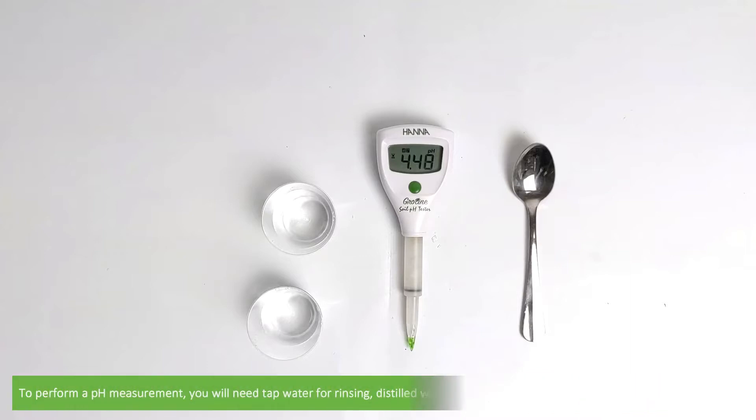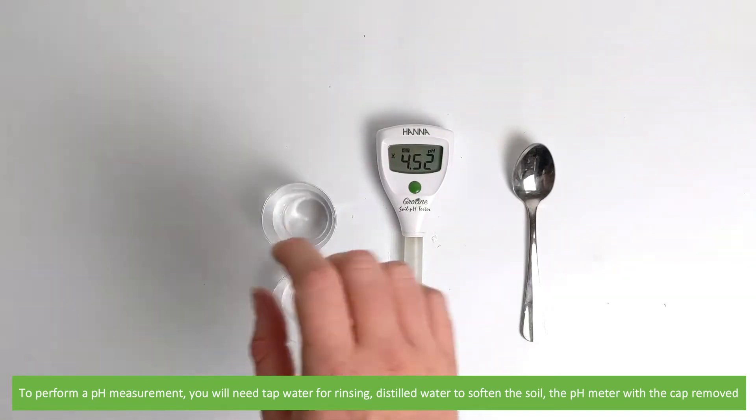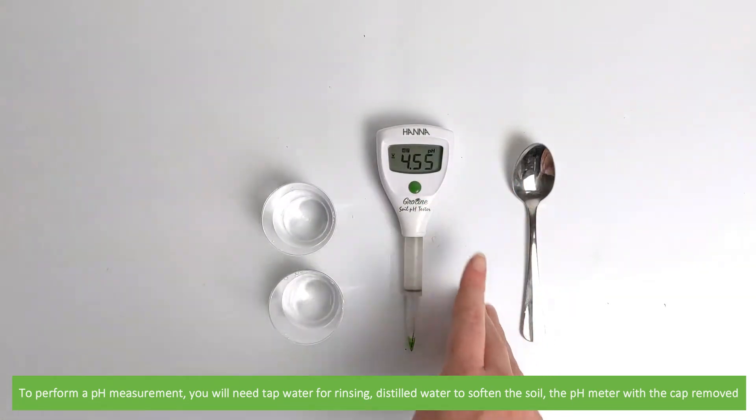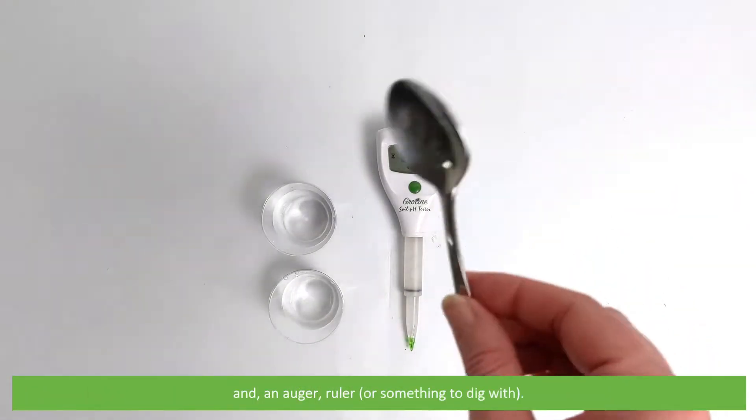To perform a pH measurement you will need some tap water for rinsing, distilled water to soften the soil, the pH meter with the cap removed, and an auger, ruler, or something to dig with.